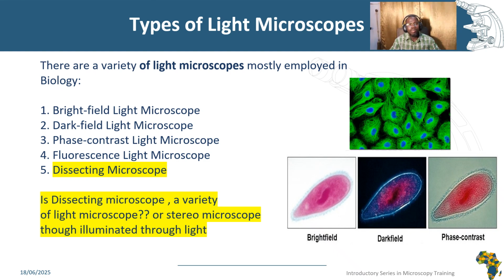The phase contrast microscope is a kind of microscope that enhances contrast directly onto the specimens. This type of microscope is ideal for observing live unstained specimens.